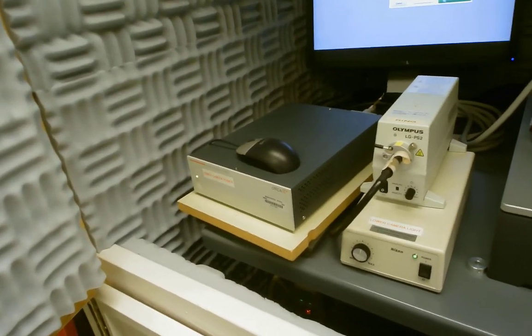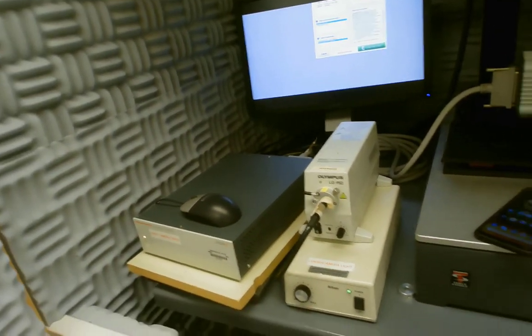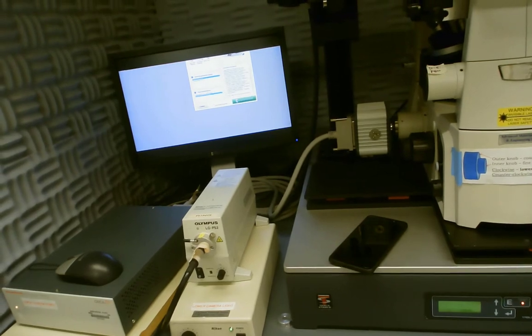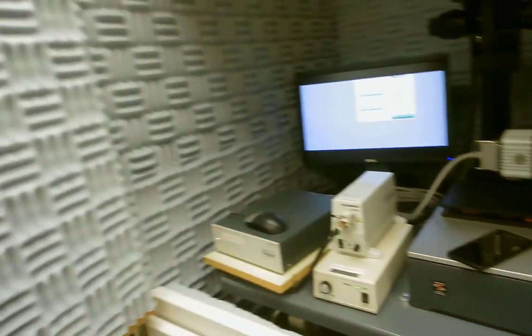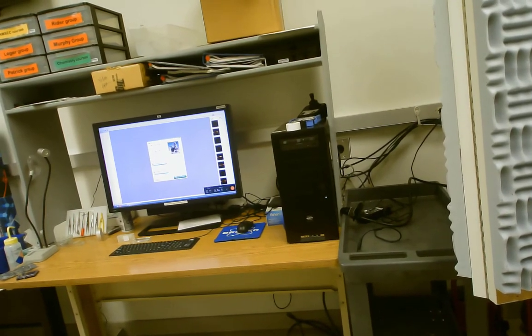And then we have some power supplies and light supply boxes so we can adjust the intensity of our light here for the upper camera.